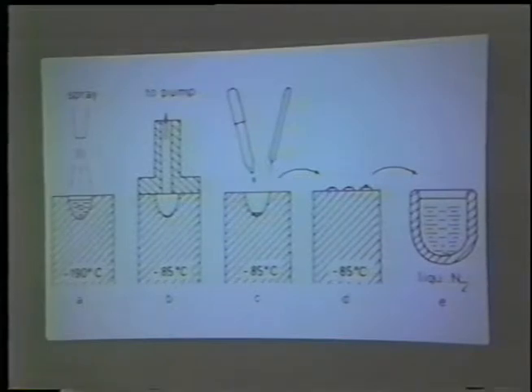And the butylbenzene, especially if it's not quite pure, often is not frozen at fracturing temperature. It's rubbery. It isn't a hard glass. You try to fracture and it smears and just covers up everything with butylbenzene. You don't see anything. So there are a lot of problems with the technique.